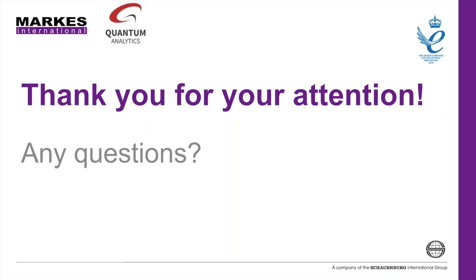Yeah, so if you load your internal standard prior to recollection, you will have your internal standard on your recollection tube as well. So it works in the same way, essentially. You know how much internal standard you put on, you know how much internal standard then got injected into the GC, so you can then work out from that what concentration is left on your TD tube.